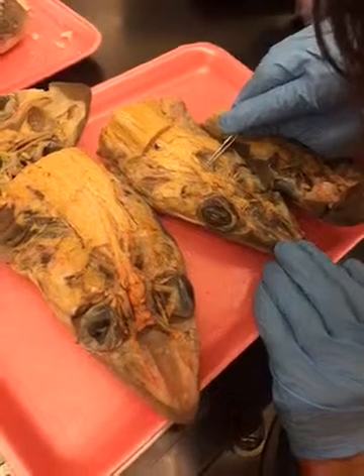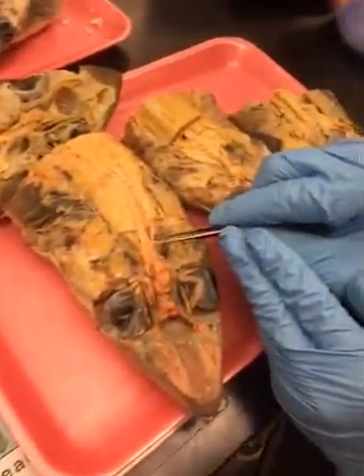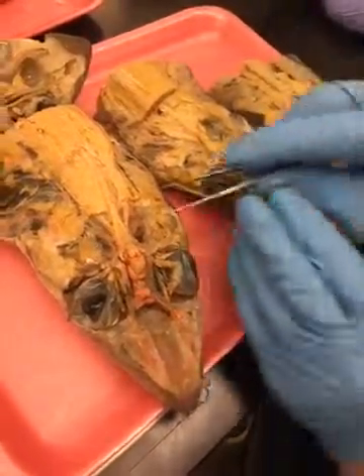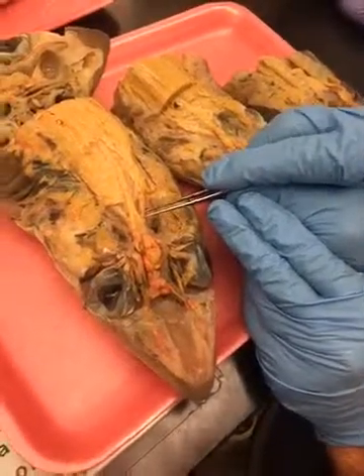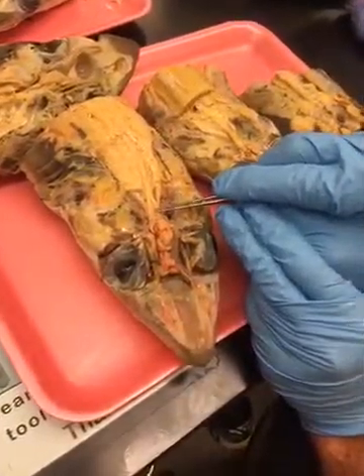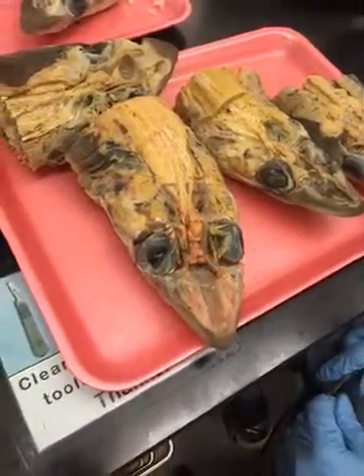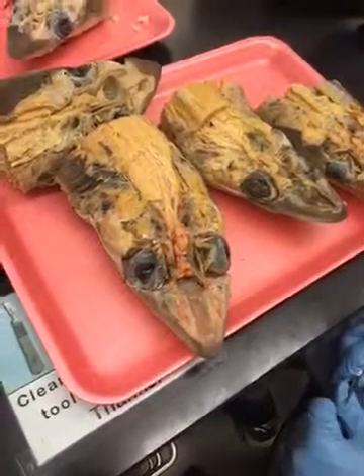Now there's a cavity in the medulla, which is the fourth ventricle. And it's very nice on this one, fourth ventricle right there. And that too is covered by a thin telechoroidea, which I think is still there, but is sort of sunken down. Those are the parts of the brain. Now for the nerves.